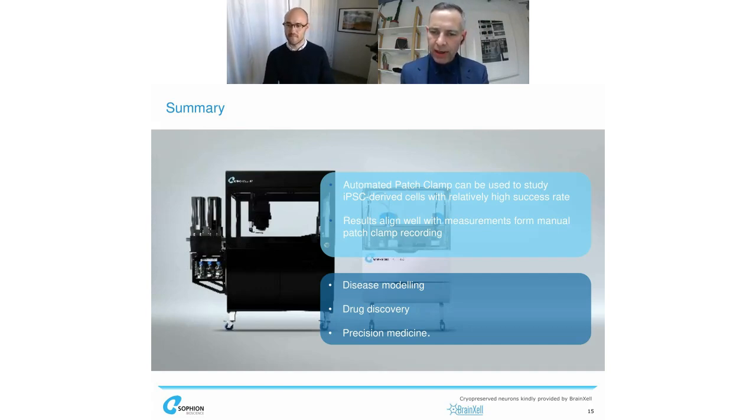And on a similar line, Charles was asking, how long did you have to differentiate the cells to get electrophysiologically mature neurons? Yeah, so I think it's probably going to be an averaged answer. Some of them would, of course, be mature cells that are firing action potentials already early on. There might be a benefit of waiting longer. The action potential that I've shown you here was recorded at day 7 in vitro. There's likely a benefit, from the functional expression pattern, that you wait a little bit longer, but you're probably just shifting the average. I think you probably get already good recordings after day 7.